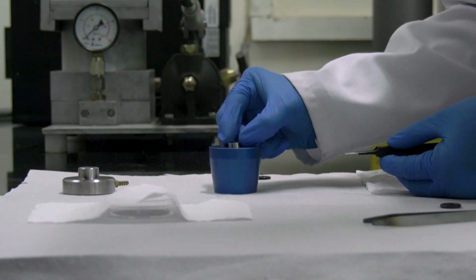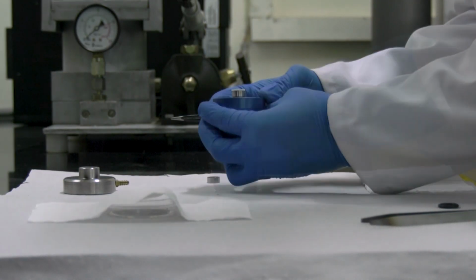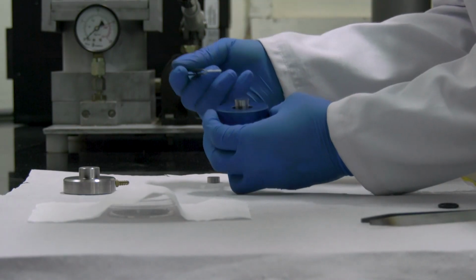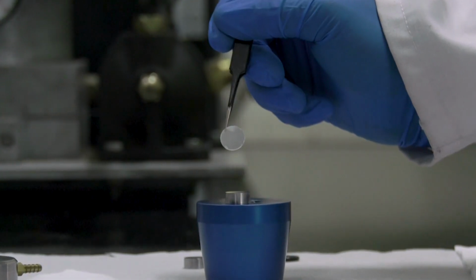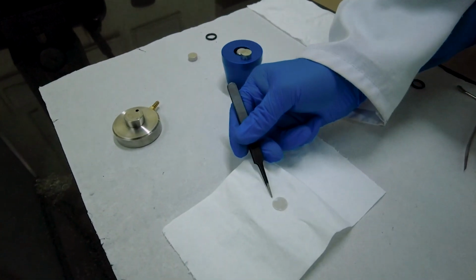Take out the pellet carefully using forceps with a sharp pointed end. Now you can see the pellet. Store the pellet in a tissue paper to avoid moisture.